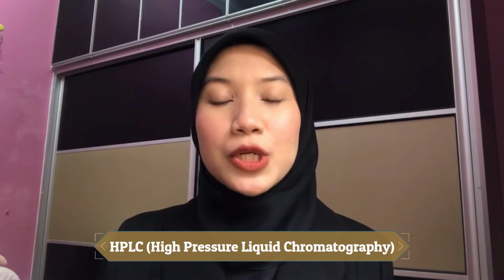I will explain to you about one analytical technique that is used in the food industry. The analytical technique that I choose is HPLC, which is high pressure liquid chromatography. In the first part, we will see how the food industry uses HPLC in their everyday activities.